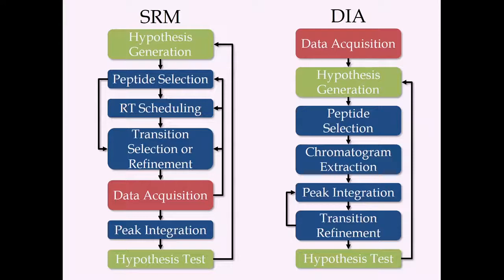In practice, it tends to be a little complicated to interpret these data. So this is something that everyone's still working on to make easier. But still, I think this is basically the reason why people like this. In fact, it tends to be very appealing for core labs in particular, because in theory, you could collect data once on a very valuable set of samples, and then use that to go back and have people ask new questions over time.